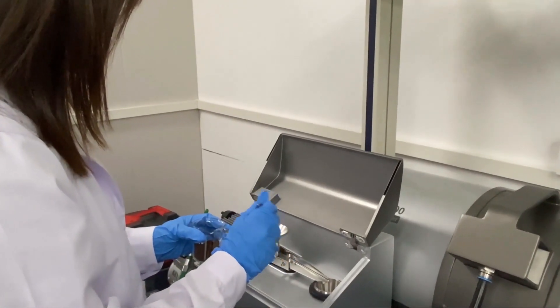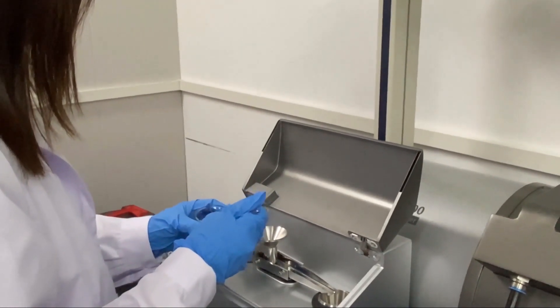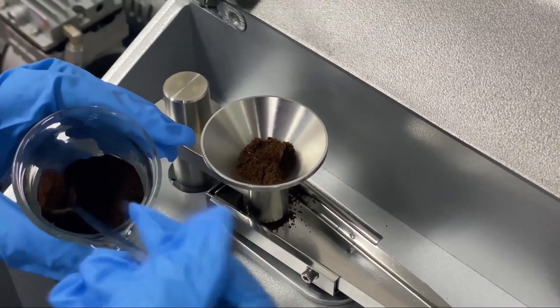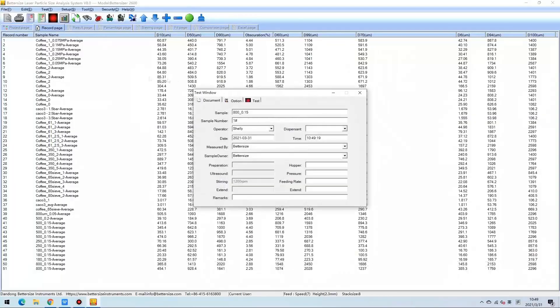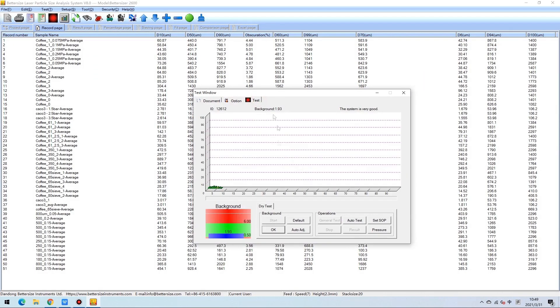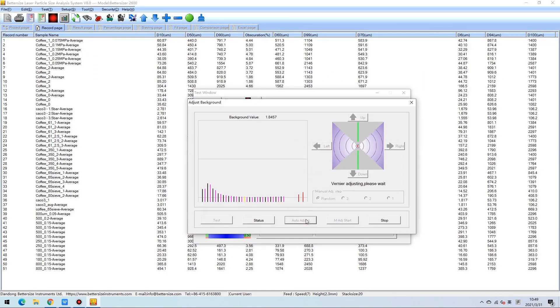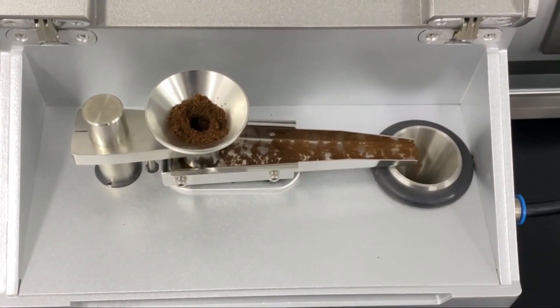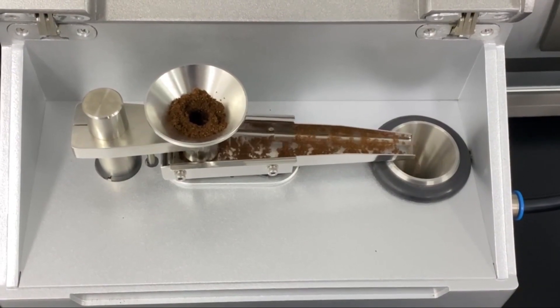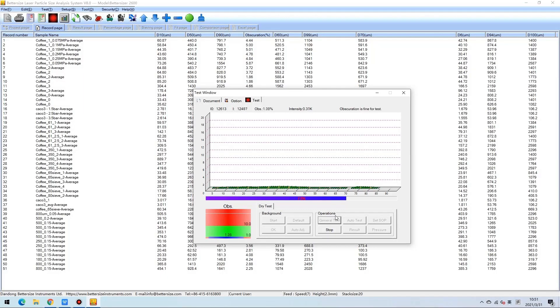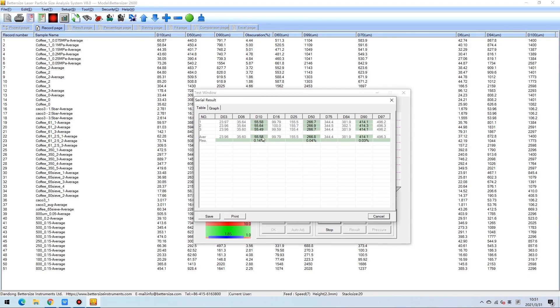First, we need to add some coffee samples in the funnel, which will send the samples to the vibrating feeding tray when measurement starts. Then, operate the software on the computer by entering the sample's information and click Start Measurement. Repeat the procedures for all four coffee grinds.